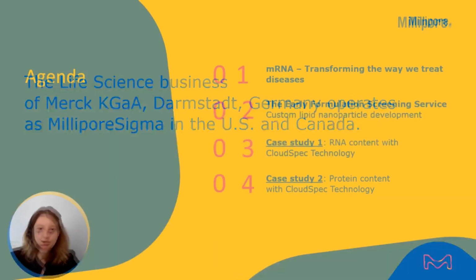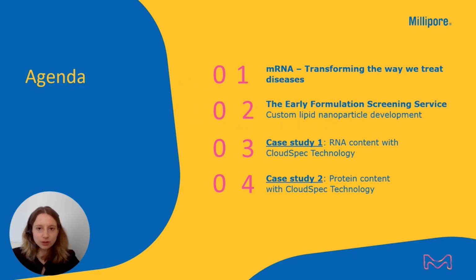In my presentation today, I would like to get started by giving you a short introduction into the RNA field and where we as a company see the huge potential of this novel modality. I would like to further highlight where we as the Early Formulation Screening Service team are supporting the development of novel RNA-based medications. And this will lead me very nicely to my two case studies, one focusing on RNA quantification using the CloudSpec technology, and the second one focusing on protein quantification of so-called antibody functionalized lipid nanoparticles.